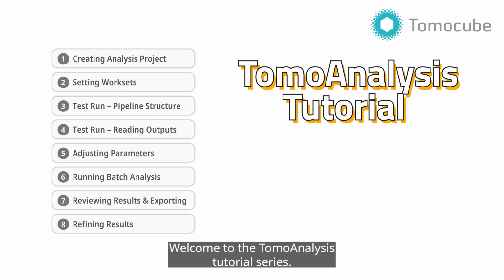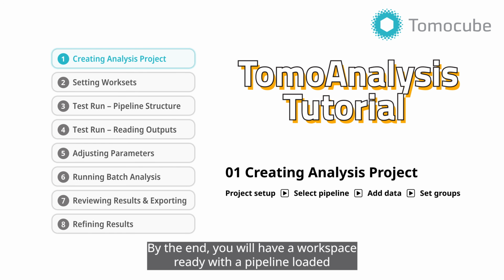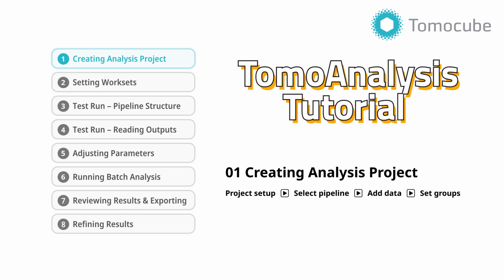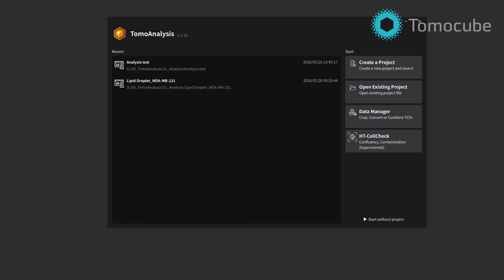Welcome to the TomoAnalysis tutorial series. In this first video, we'll create an analysis project. By the end, you will have a workspace ready with a pipeline loaded and data files added. Let's get started. When you launch TomoAnalysis, the Start screen appears.